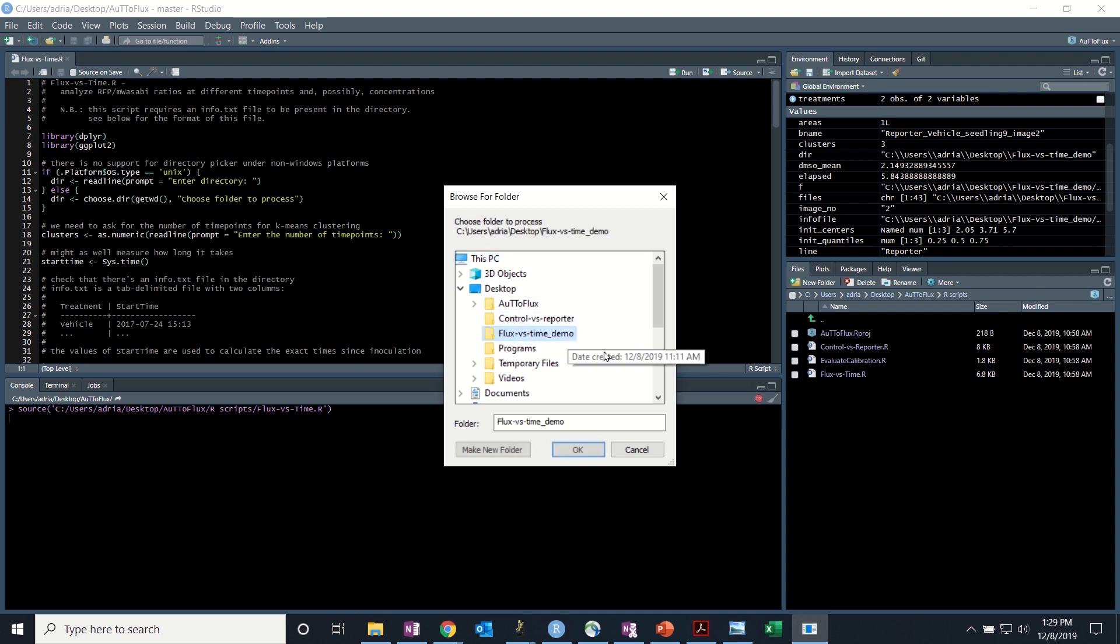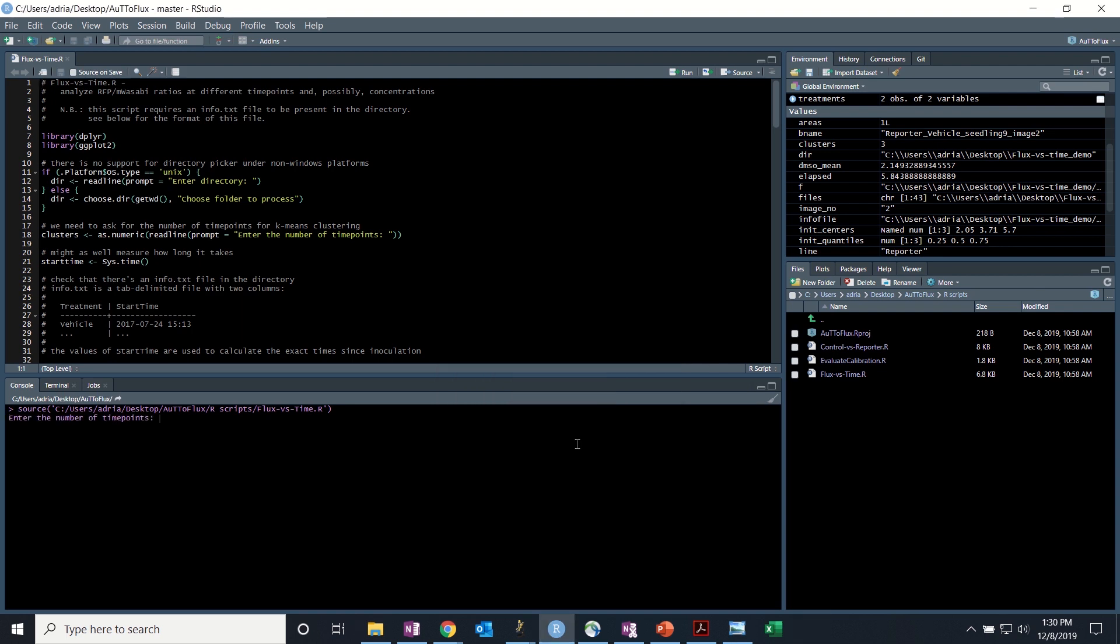For this we'll use flux versus time demo. Hit OK. And you'll be asked to enter the number of time points. For this experiment I scanned at three different time points. So we'll enter three and hit enter.